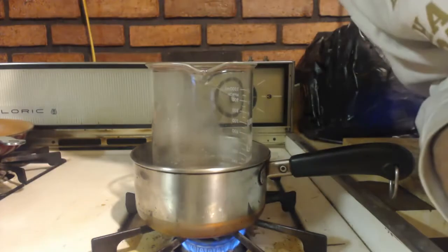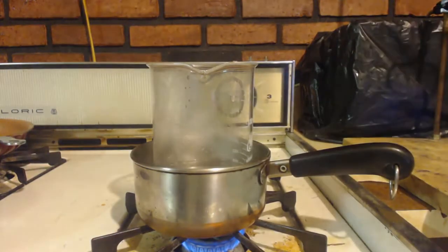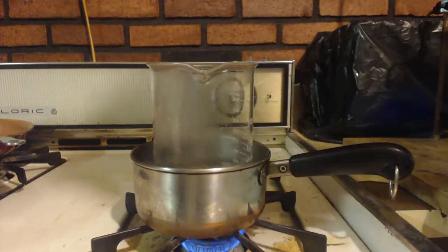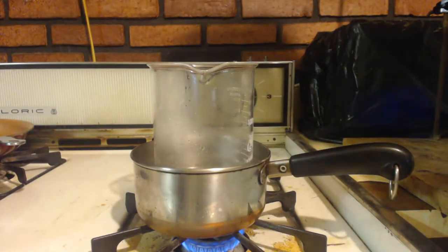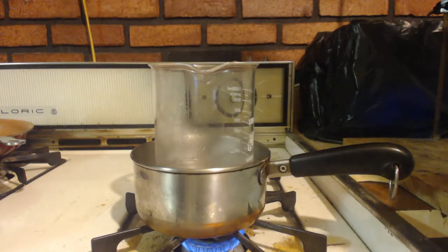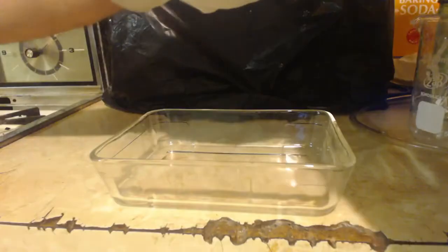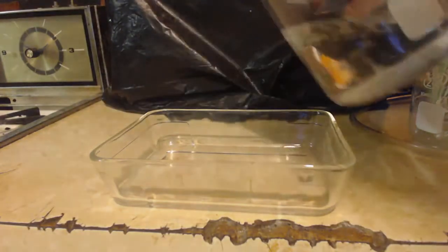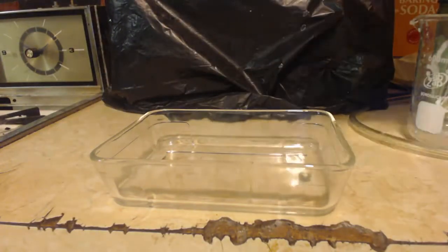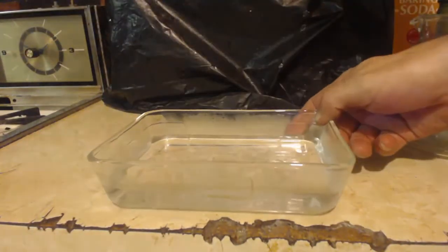I don't smell any ammonia. I thought you'd smell ammonia, but I don't. That's the nice thing about this reaction, there's no fumes, no acids, no bases. I mean, you should still always wear gloves and goggles. But you really don't even need a fume hood or anything. There's nothing nasty about it in that respect. So it's cooled down, so I'm going to pour it into here. And we'll let it crystallize from there.